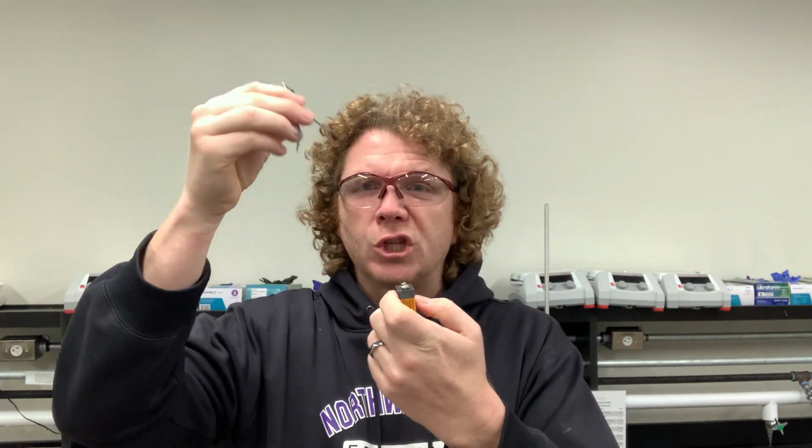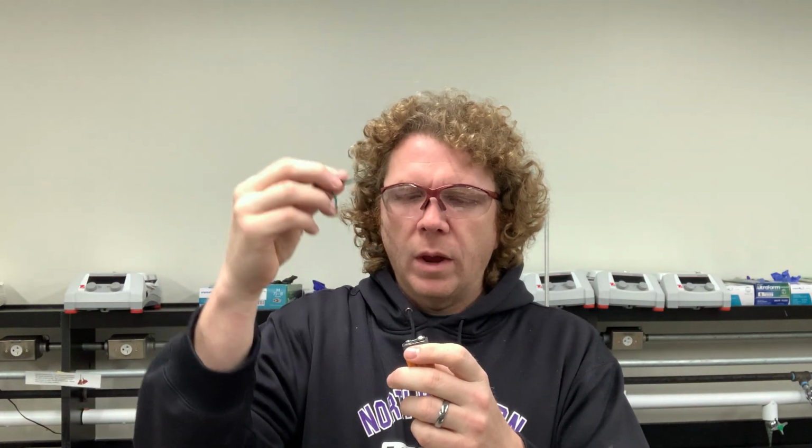All right, well, that's going to be our setup, and that's going to give us confirmation that our light system is functional. In the event that you run into a problem in any of those, then speak with your IA and say, hey, I need a new battery. Or what sometimes happens is some of these lights are a little bit older, and if you just switch the electrodes that the 2 wires are going to, then it might work. Because some of them are lights that go in different color and some that are just clear. Okay, so that should help you with your positive and negative controls.